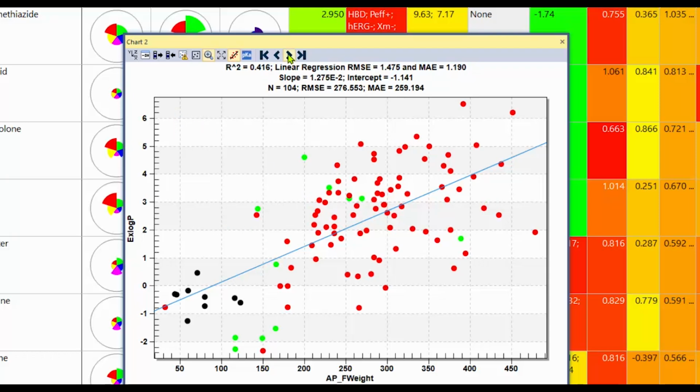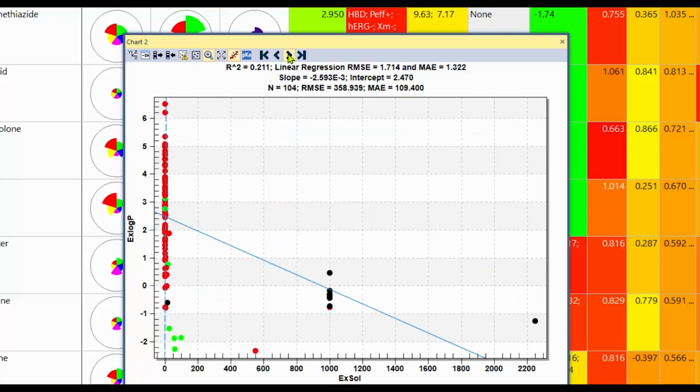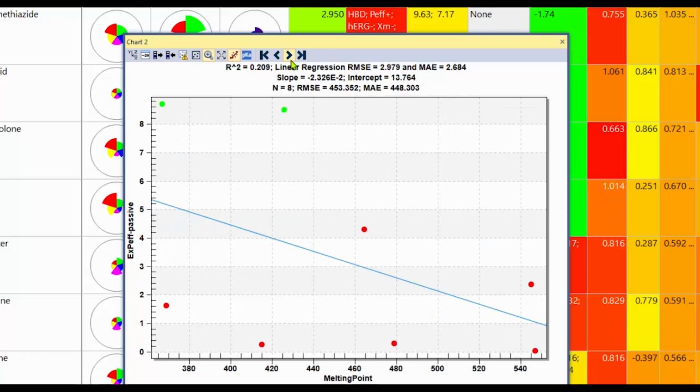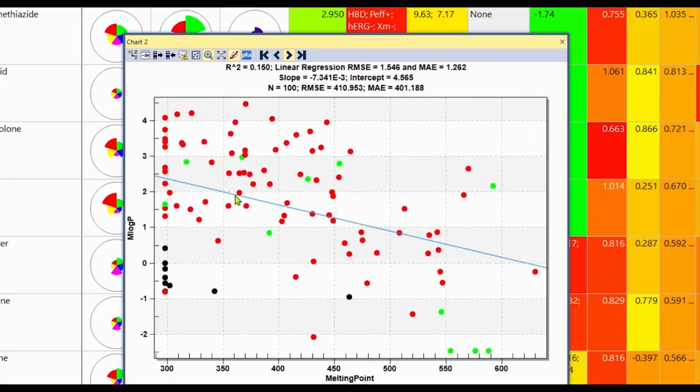And then again, we can use this widget to go to the next value. So here it's changing the x-axis you see here. So this value down here keeps changing. If I hold the control button down, then the y-axis changes. So you can loop through the various column types and plot them on this plot here.